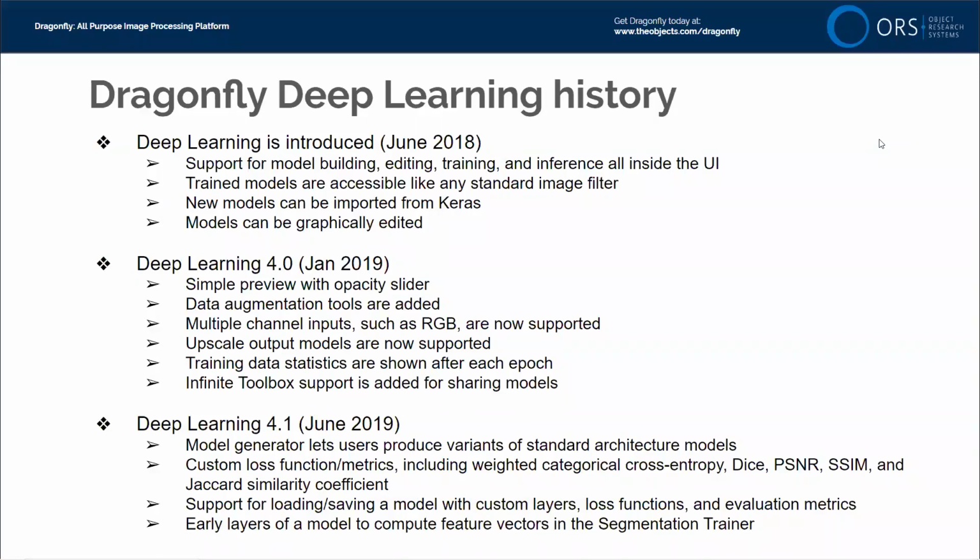We made it about the time we were shipping, but we could simply send it as an email, and you could put that in the right folder, and then in your list of models that you can generate, it would not only include the 4 or 5 you see now, it would also include the WDSR. We also introduced new loss functions, such as weighted categorical cross entropy, the dice score, etc. These are very useful in helping you evaluate image segmentation models.